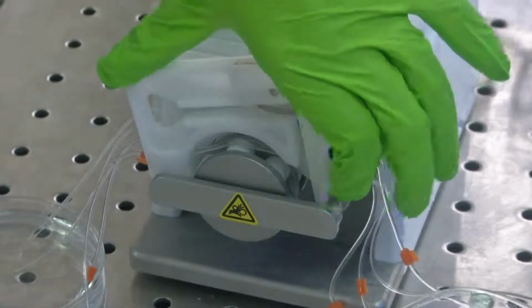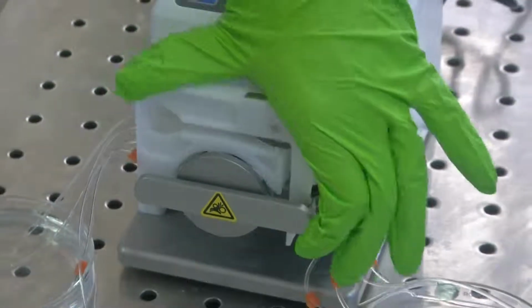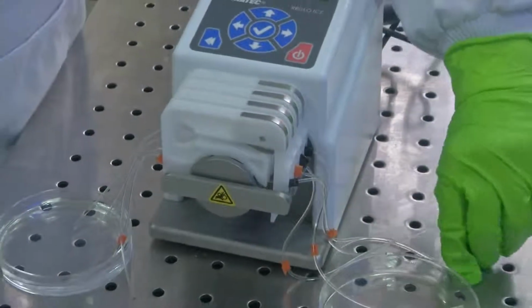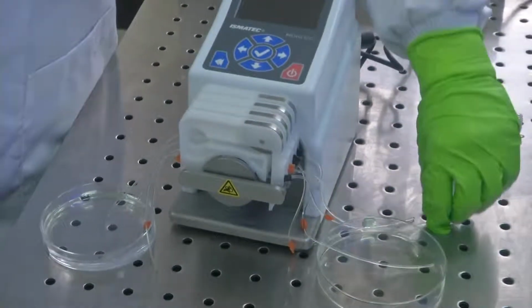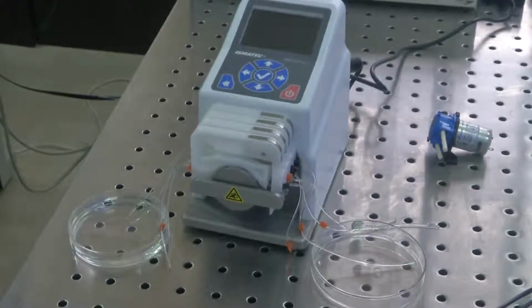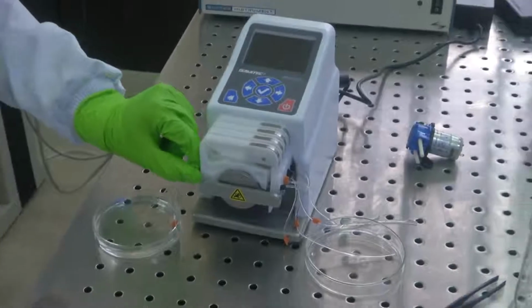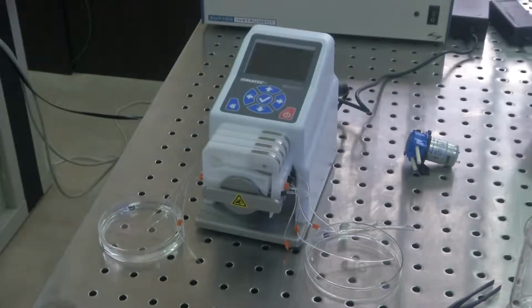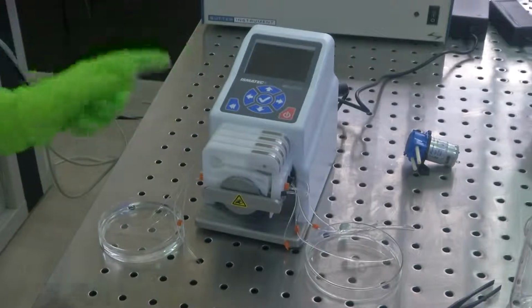So this is more like a positive displacement pump. It pumps the fluid out in the direction in which the roller rotates. Now you can see these do not have a valve or seal. So this is a very inexpensive pump, and it permits easy flow of solids and viscous media. So let us see how each of these functions.